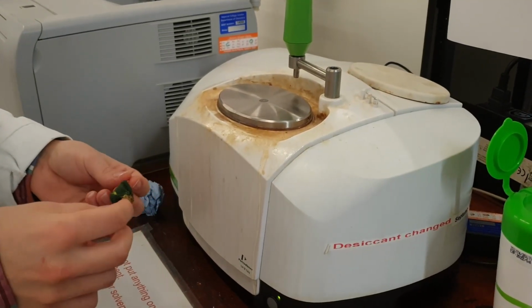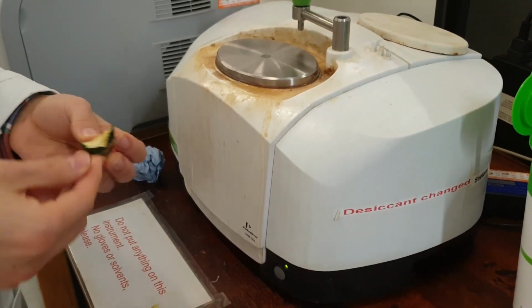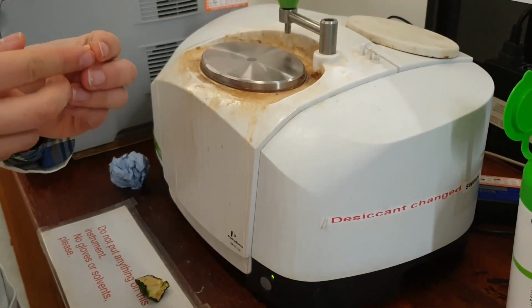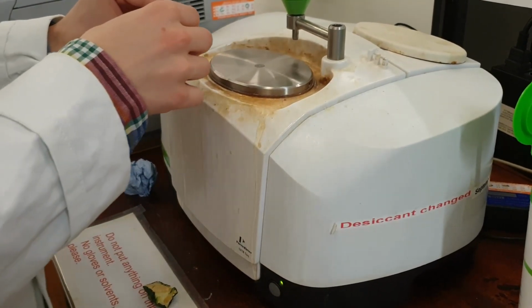Right, so we're doing our spectroscopy on courgette here. I've got some courgette that's kind of dried out. It's still a bit wet on the inside, but anyway, I've got a chunk from it here. We're going to do IR on this. We're definitely going to get a hydroxyl peak. There's still a lot of water in here.